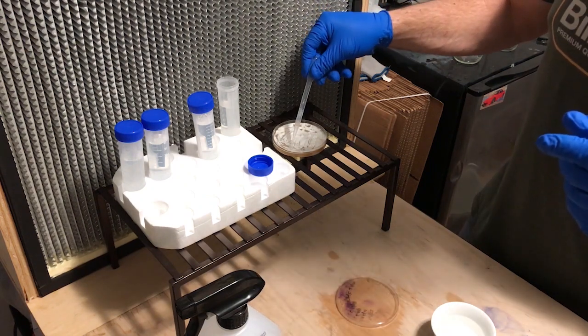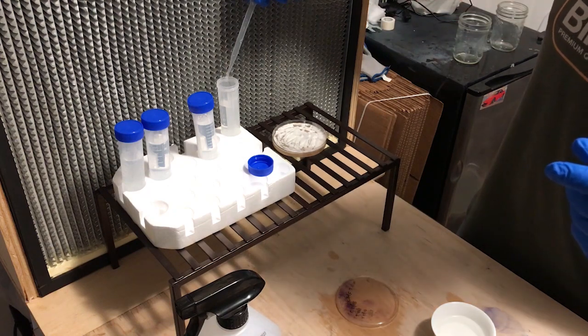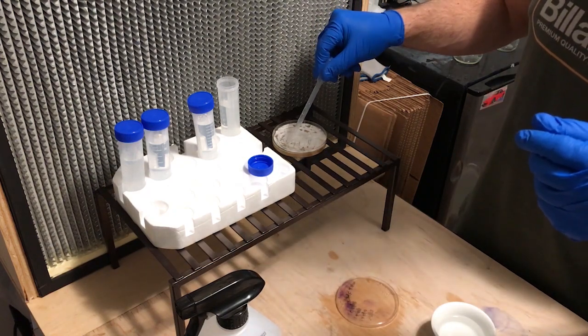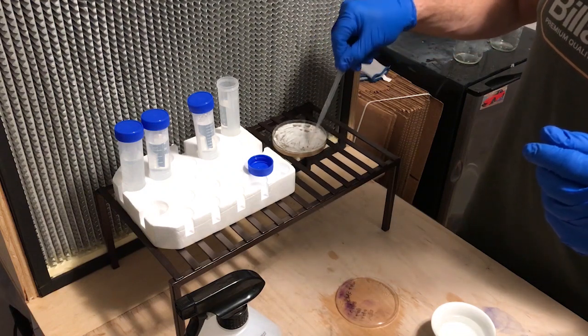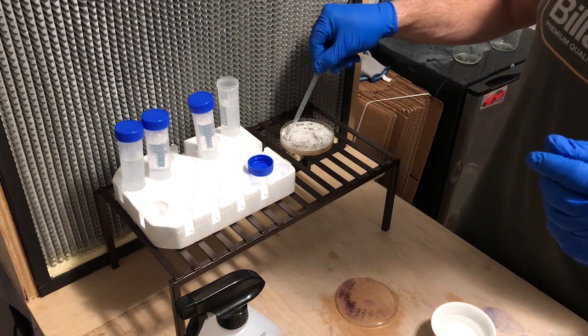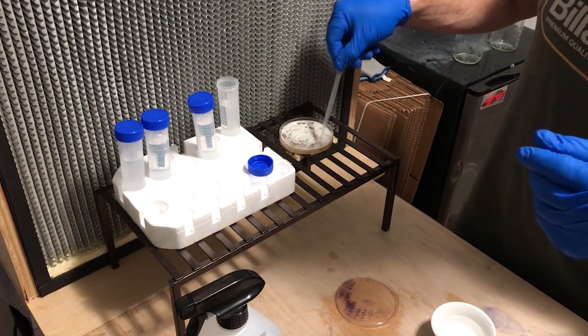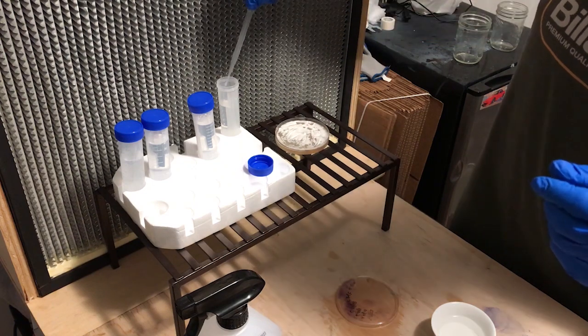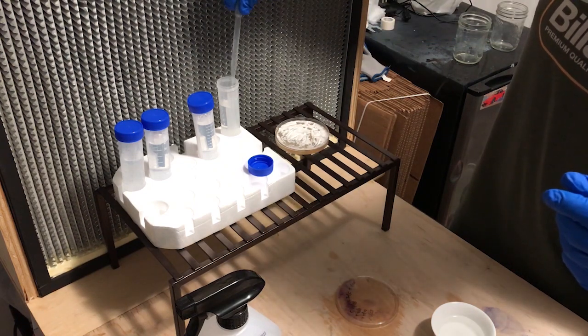The distilled water has no minerals and because we've sterilized it, it has no nutrients. So there's nothing for the mycelium to live on, which means it's going to go dormant. That will allow the mycelium to live for somewhere between three and ten years, making this a really good solution for long-term storage.